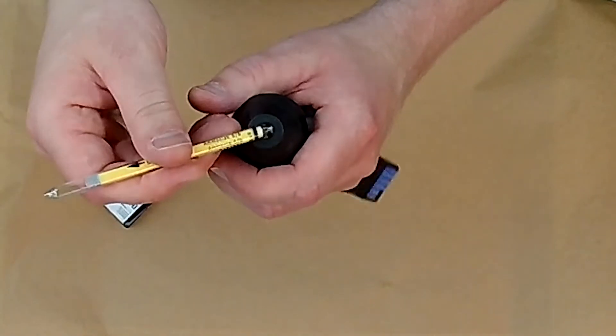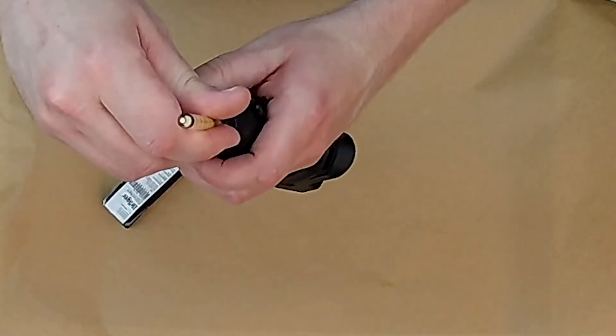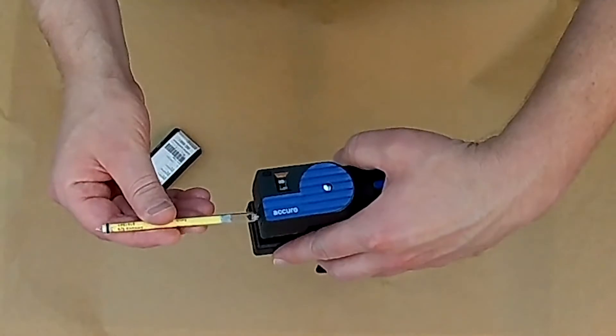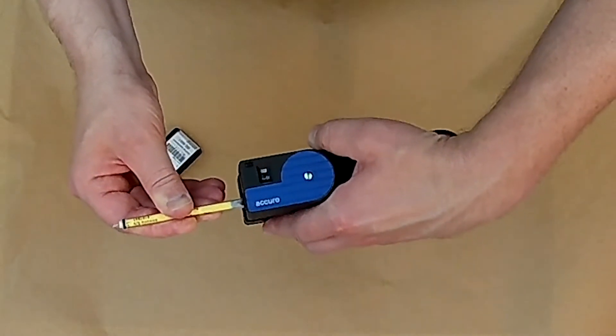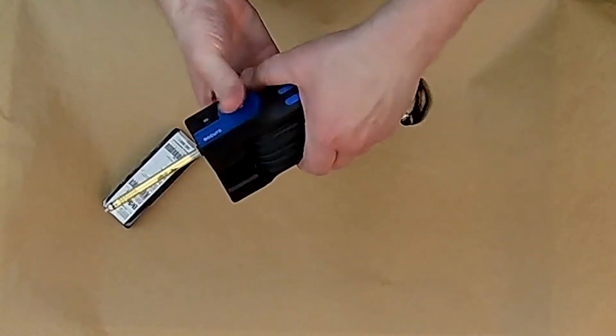Both ends of the glass tube are broken off, then the tube is inserted into a handheld sampler pump that costs between $400 and $700.